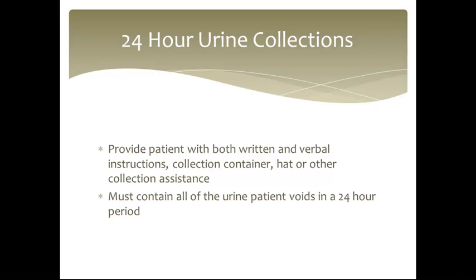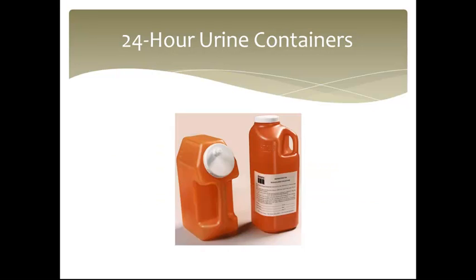Typically, we like them the same day so the urine components and electrolytes are not compromised, because as time goes on, the urine quality is not as good as right away when it's first excreted. Here is an example of what a 24-hour urine collection container looks like.